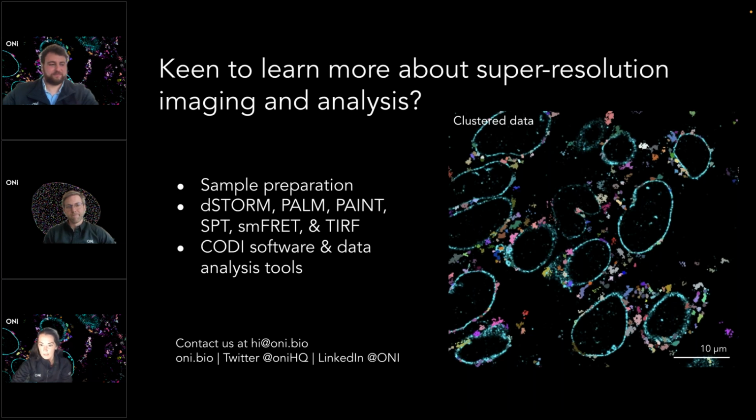All right, great. There seems to be lots of interest in the drift correction. So one person asked, what are the main differences between the drift correction methods available in CODI? Yeah, so the algorithms themselves are all detailed in the big question mark button. I think we have 3 methods at the moment. One is called direct cross correlation.